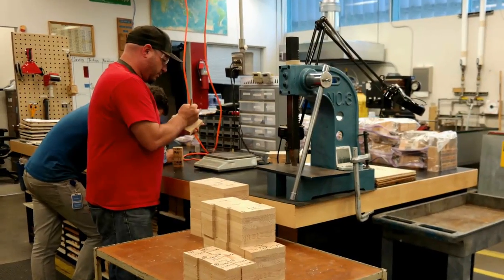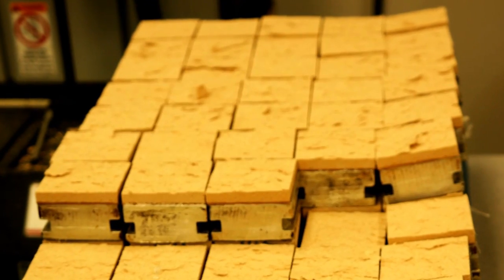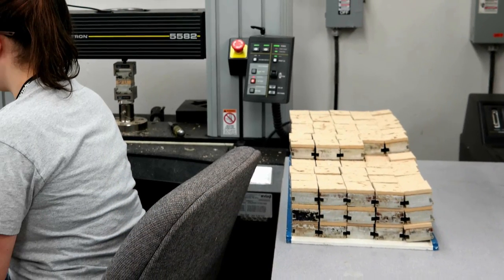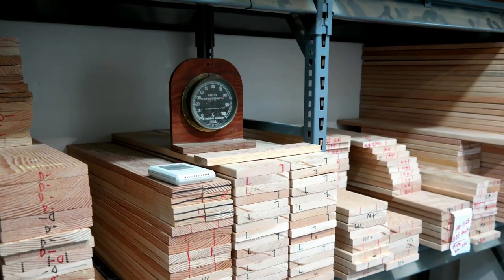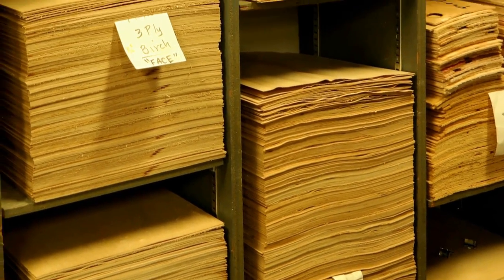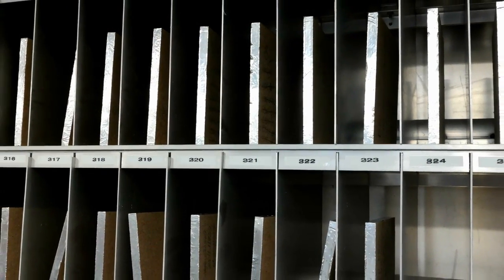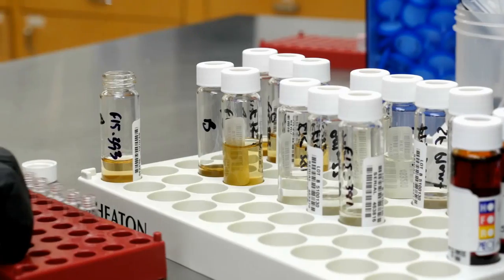All information and data are treated without bias, coded and blinded so that its source is anonymous to the analysts and others involved in the testing and reporting process. Once samples are received and catalogued, conditioning begins, which typically takes a week or more. Conditioning is done using state-of-the-art atmospheric temperature humidity controls and equipment.